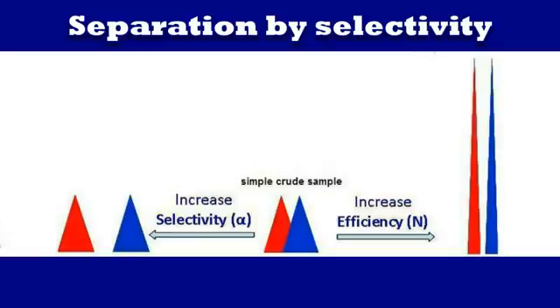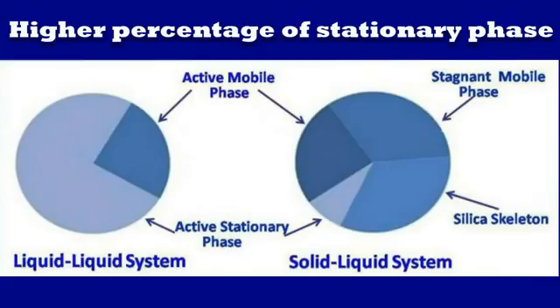Selectivity is the dominant driver for separation and resolution of compounds rather than efficiency, as is the case in most other liquid chromatography methods. This difference demonstrates the orthogonality of the technique and is shown diagrammatically here. Conditions in a liquid-liquid column are very different to either an HPLC or SFC column. In fact, it is the complete reciprocal.